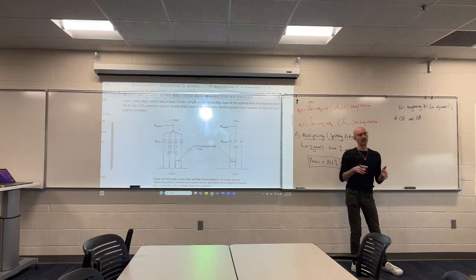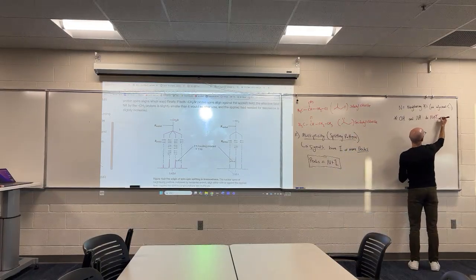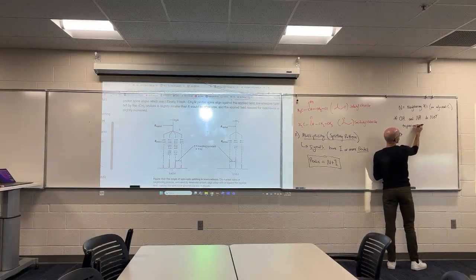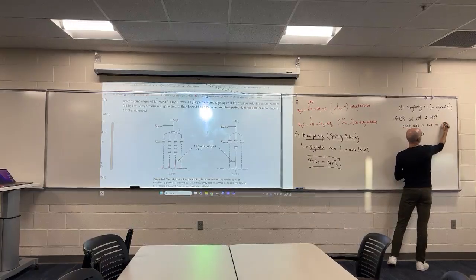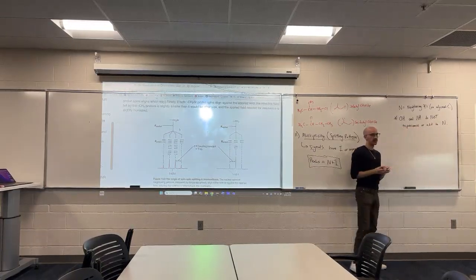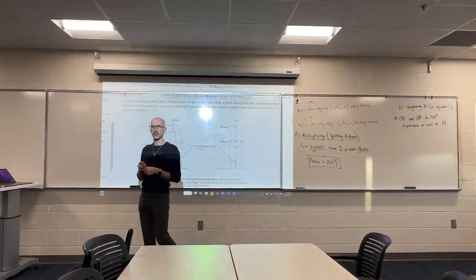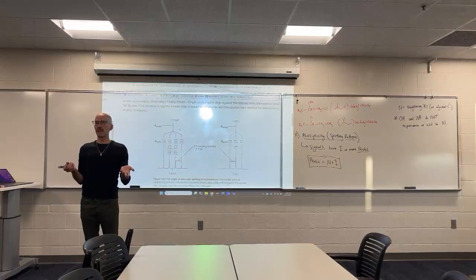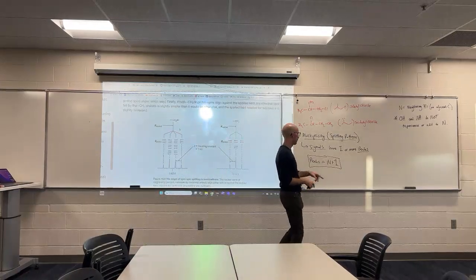These hydrogens bonded to O, hydrogens bonded to N, do not experience or add to N. So how many peaks would an OH signal always have?